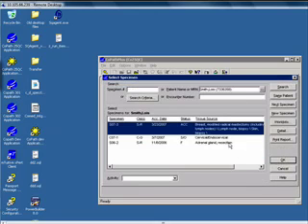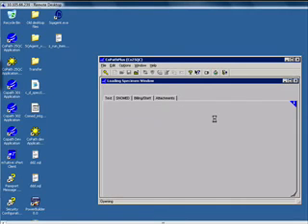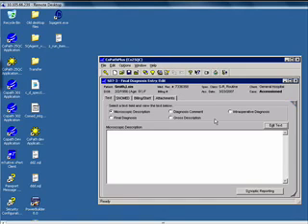And as you can see, these are the different specimens we can choose from. There are 3 specimens assigned to this case. The appropriate specimen is selected, so I'll click OK, and we'll select Final Diagnosis Entry/Edit and click OK. So, as I'm sure many of you are aware, we're at the final entry diagnosis screen, where the transcriptionist or pathologist typically launches Microsoft Word to enter report findings. We're at a spot in the case where we know there's cancer and we want to complete a synoptic report, so we click on the Synoptic Reporting button.